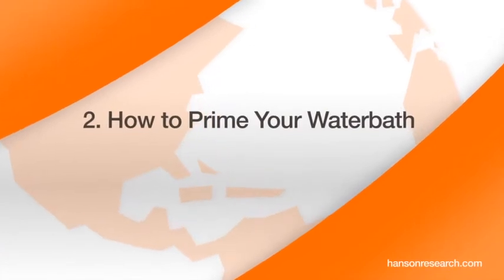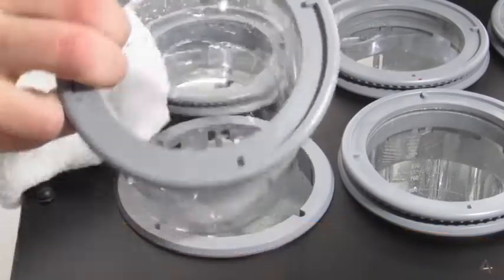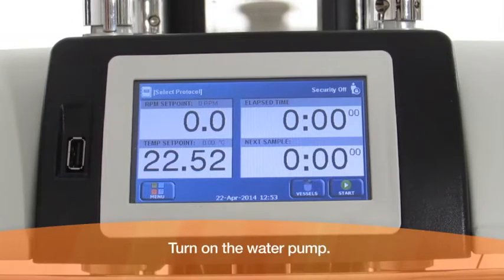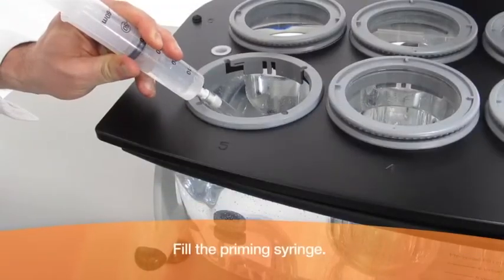How to prime your water bath. Remove vessel number 5. Turn on the water pump. Fill the priming syringe.